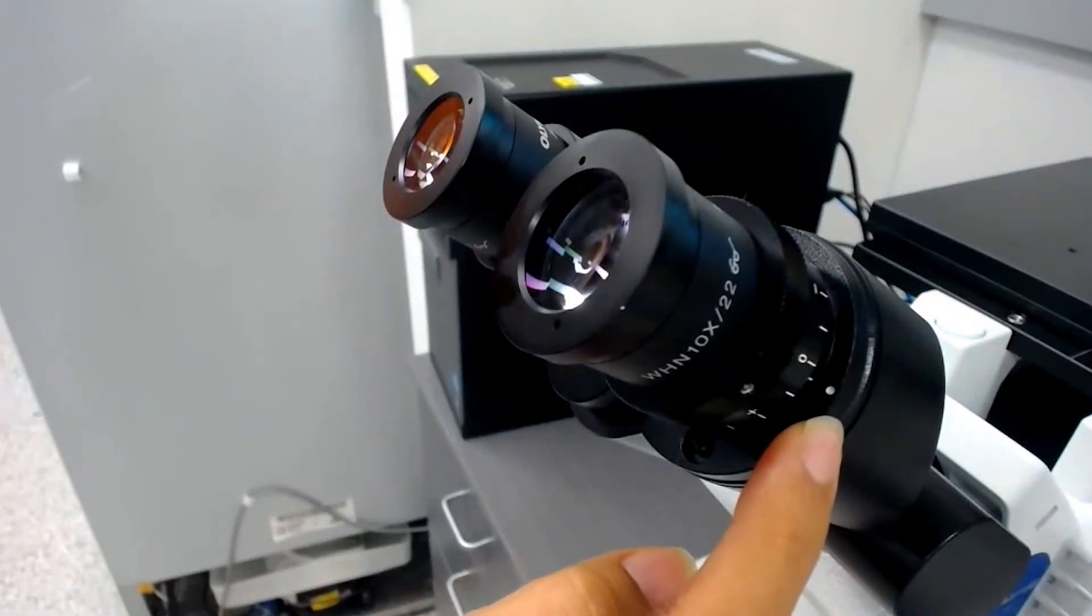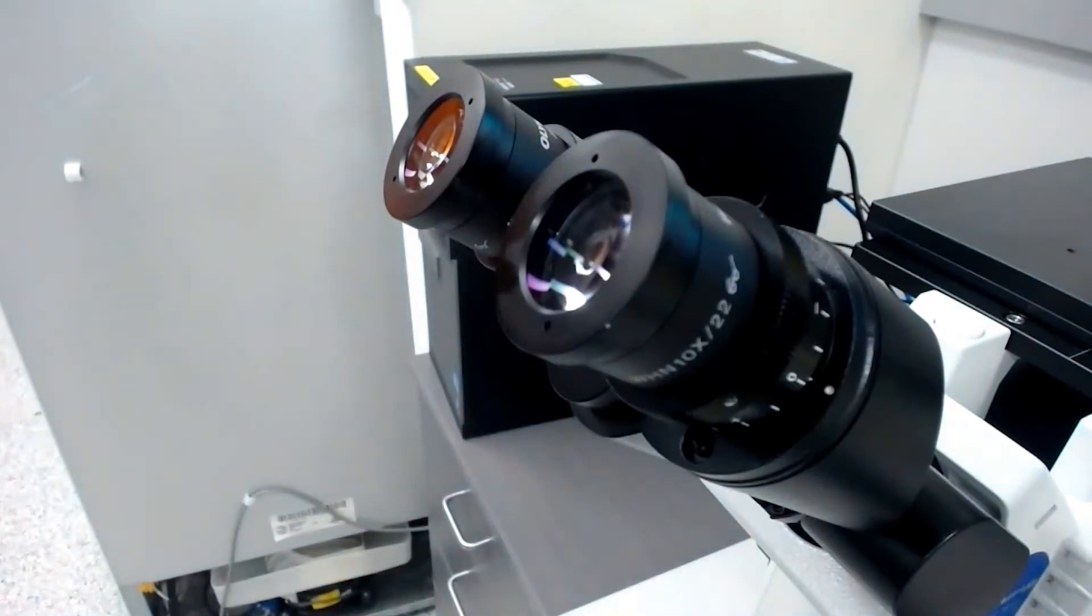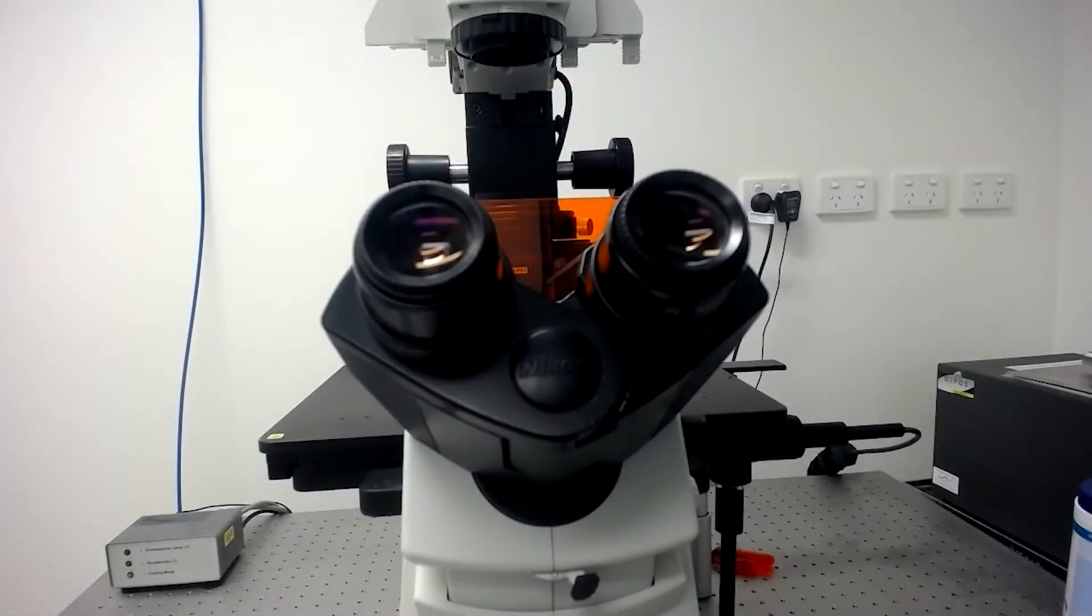Set the diopter adjustment on both eyepieces to the zero position by rotating the eyepiece as shown. Markings may vary between manufacturers and models of microscope.